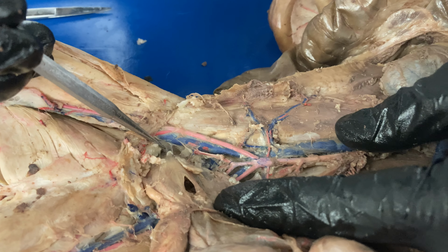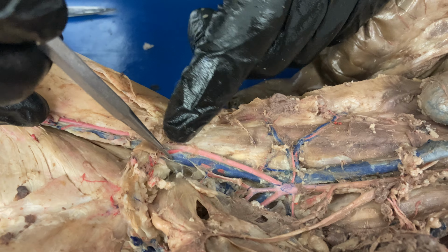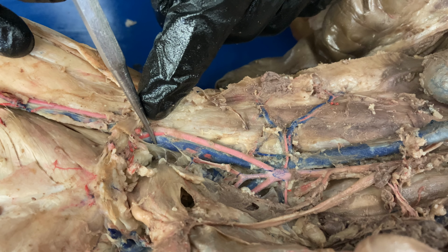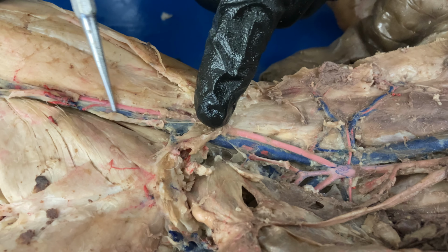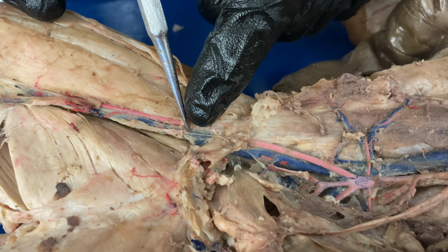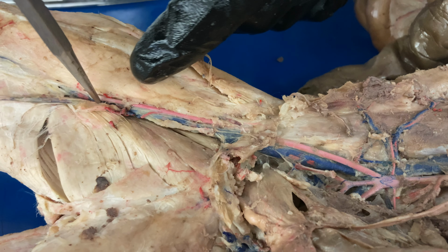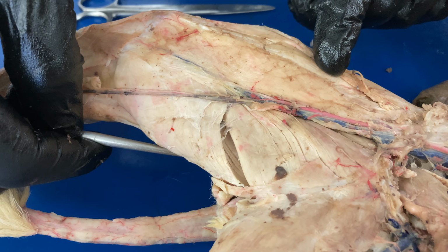The inside one would be your internal iliac vein. The outside one would continue on as the external iliac. So we have common, internal, external iliac vein. As it moves through the inguinal canal, it becomes the femoral vein. You've got that branch right there. That would be your deep femoral, which plunges deep into the femoral region. And then the same way we saw with the arteries, it's going to continue on. It's going to plunge into the back of the knee, and then you're going to see the popliteal vein in the back of the knee.